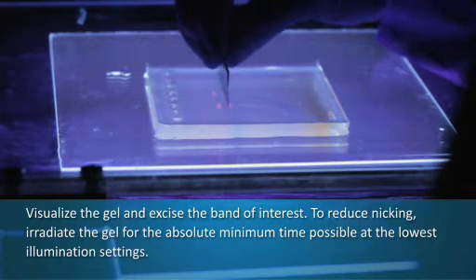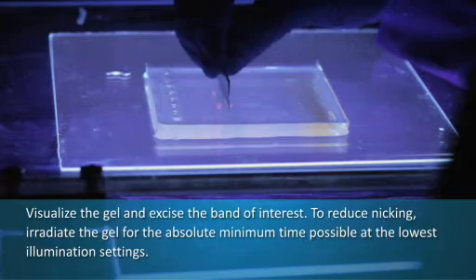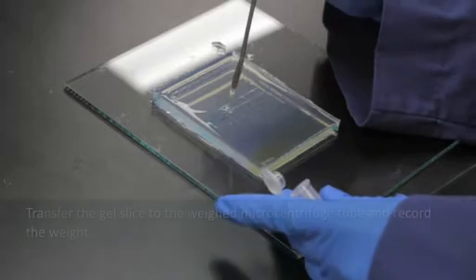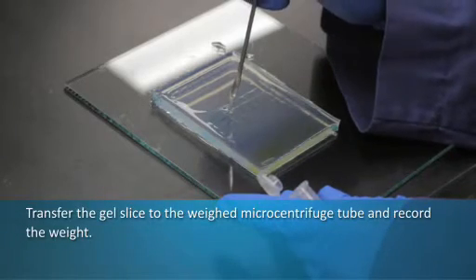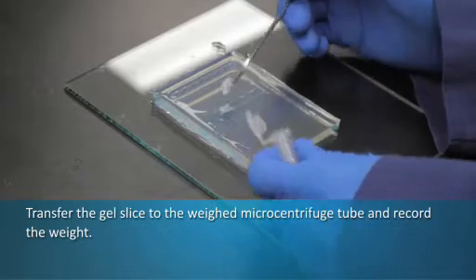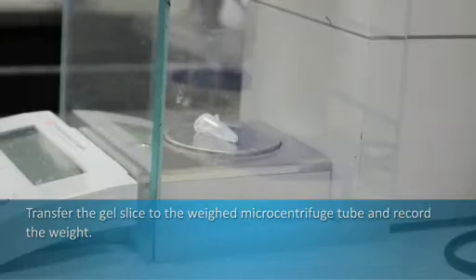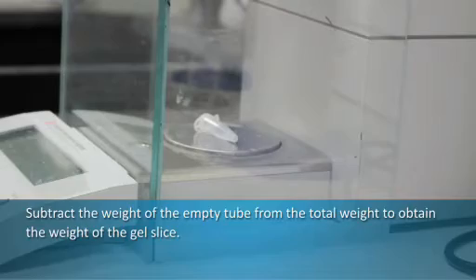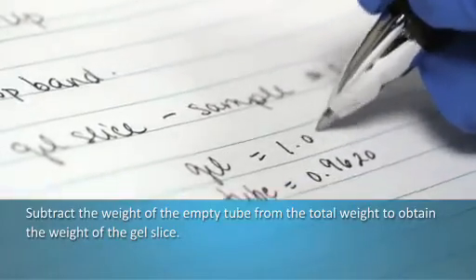To reduce nicking, irradiate the gel for the absolute minimum time possible. Transfer the gel slice to the weighed microcentrifuge tube and record the weight. Subtract the weight of the empty tube from the total weight to obtain the weight of the gel slice.